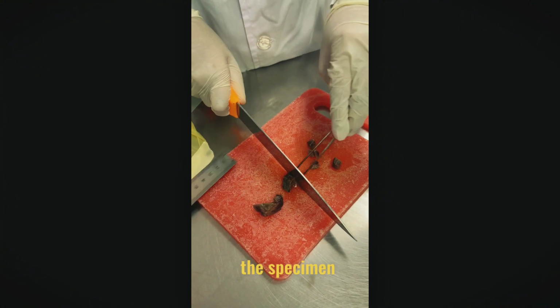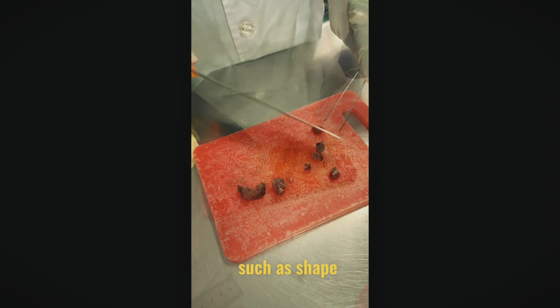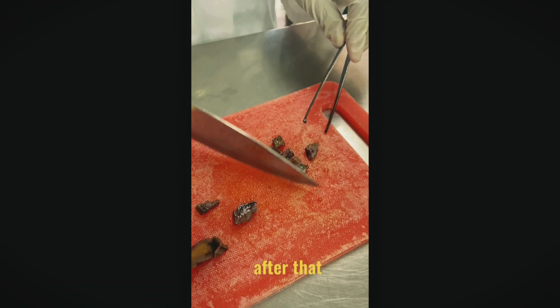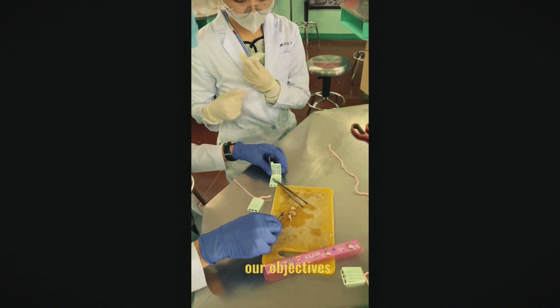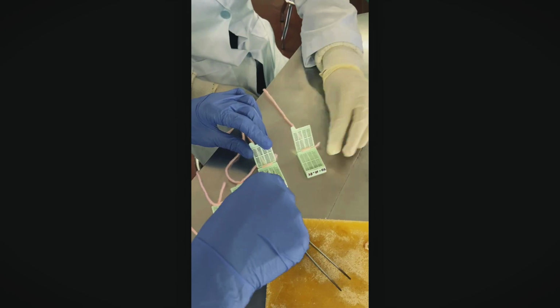Carefully inspect the specimen and note any important characteristics such as shape, color, texture, and anomalies. After that, use a ruler to measure the dimensions of the tissue. Based on our objectives, cut the tissue into appropriate sizes for processing.